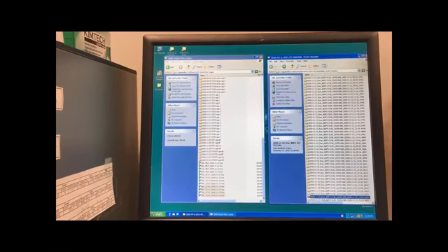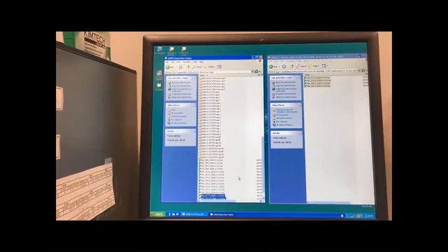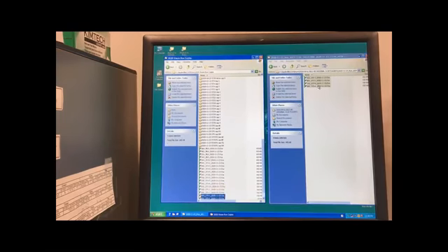Now you're probably going to go slower than this the first time you go through, but this just emphasizes once you get rolling, and you don't lose your spot and you know where you're at, it's Control A for all, Control C for copy, and then over here, Control V for paste. Okay, so that's what I'm doing. I'm pasting all of these, and as long as you hit that back button, you don't lose your place. You just click on the folder below it, and you should be in good shape.